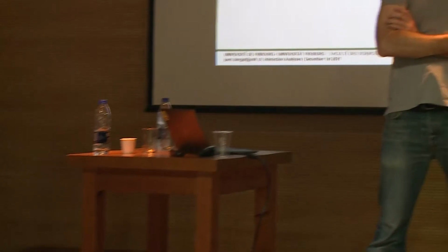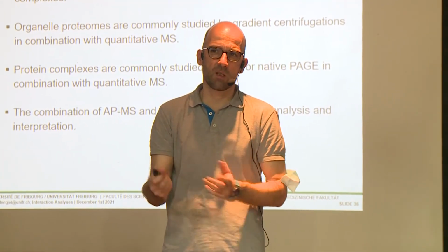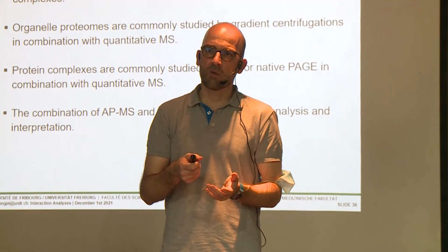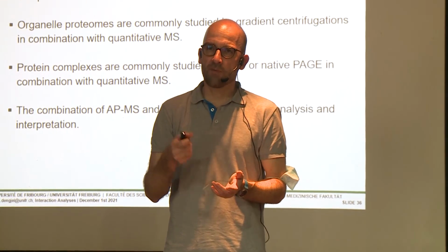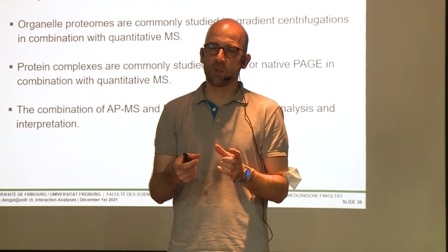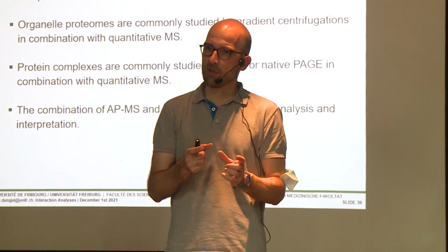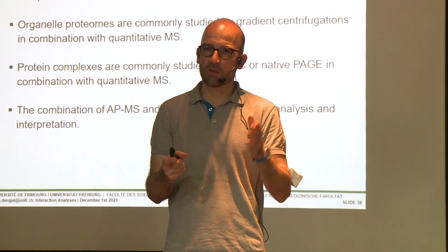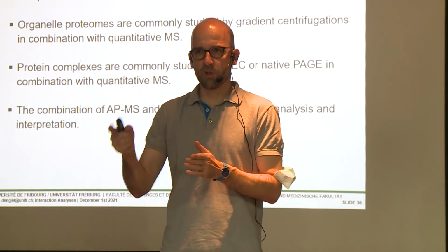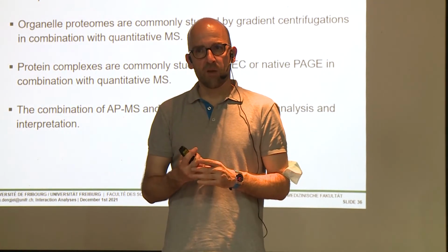For the size exclusion data, we found that this is very reproducible. We basically opened the cells with a classical Dounce homogenizer without any detergent in the sample, and after you opened the cells, of course, we kept the ratio of buffer and cell pellet always constant. Because you only do two centrifugation steps before you go on the SEC column, this is really very reproducible.